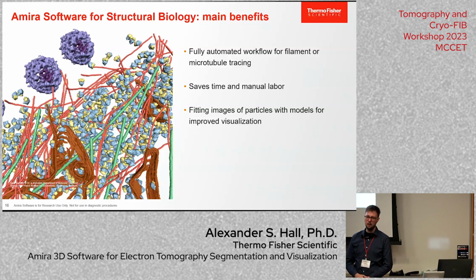And then we sample whatever other point, how far away was it from the nearest surface of the nuclear pore complex, if that makes sense. You can represent that as a number, or you can visually see it as well. You can actually colorize how far away points are. Since it is a visual tool, that can sometimes be more interesting or useful to you.